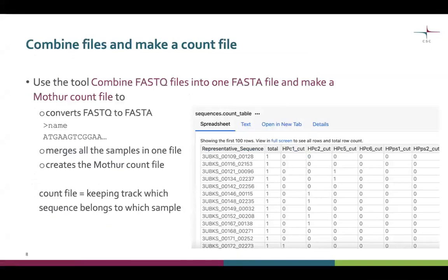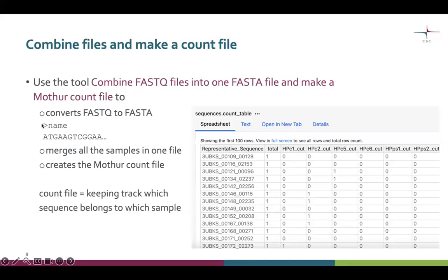Next, we will combine all our sample-specific FASTQ files into one file. This is done with a tool that first converts FASTQ files into FASTA format, so we get rid of the quality scores — we have already done the trimming and filtering based on them and no longer need them. The FASTA file contains only the name of the sequence read and the nucleotide sequence for each read. This tool also merges all the samples into one file and creates a count file. The count file is how mothur keeps track of which sequence belongs to which sample.